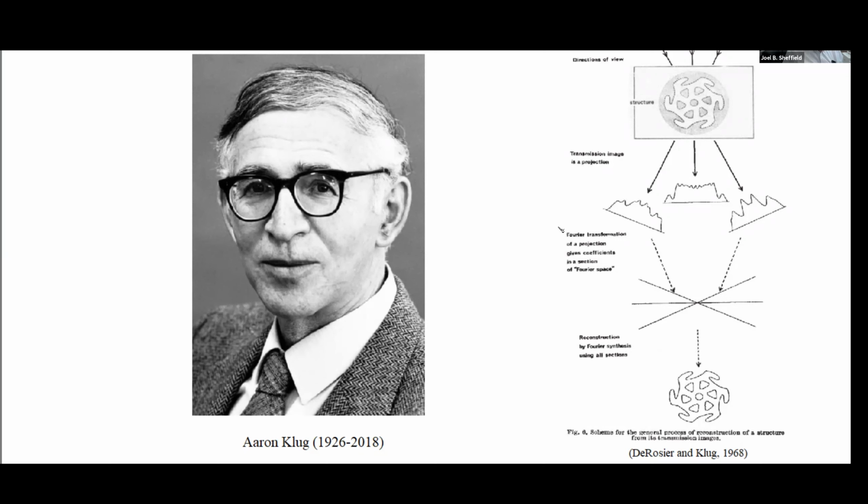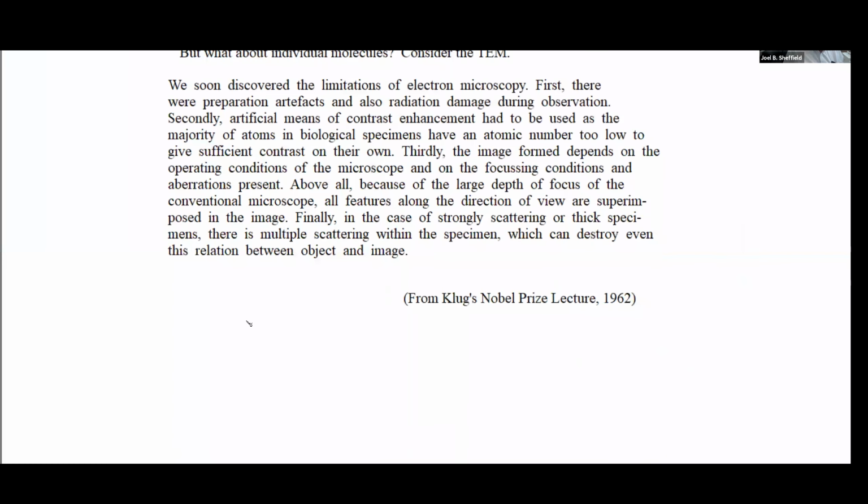And he developed a mathematical approach, which involves Fourier transforms, which I'm not going to go into, in which you basically create a family of views of the object and then assemble them into a three-dimensional image. And I'll show you, he applied that eventually to using the transmission microscope as well as X-rays. So here's the interesting issue that people came up with.